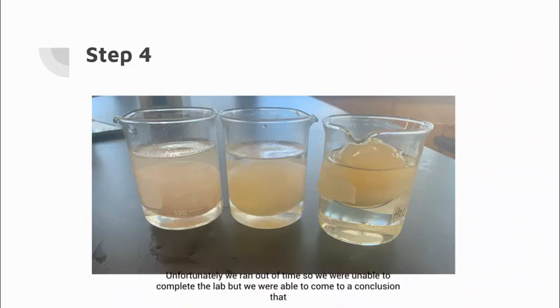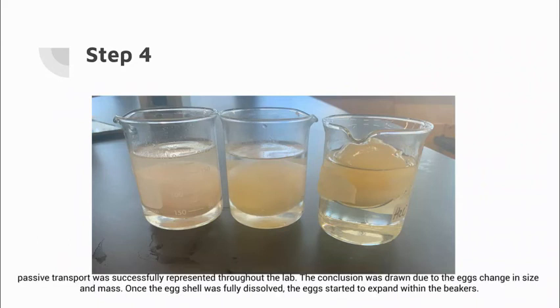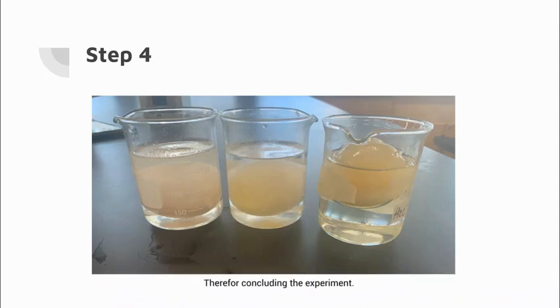Unfortunately, we ran out of time and were not able to complete the lab, but we came to a conclusion that passive transport was accurately represented throughout the lab. We came to this conclusion because the eggs not only grew in size but also in mass. Once the shell was fully dissolved, the eggs started to expand within the beakers, therefore concluding the experiment.